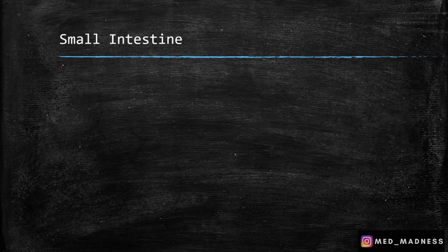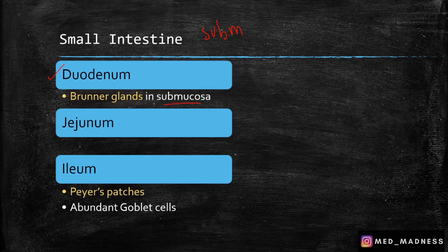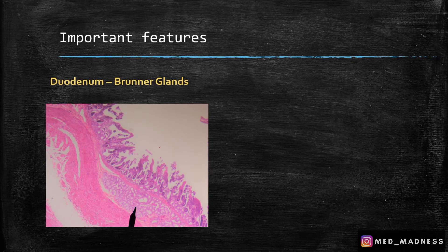The crypts of Lieberkühn are important because they contain stem cells and Paneth cells. The stem cells help in regeneration of cells, and Paneth cells help with secretions that protect the GI wall. Now I'm going to cover the different parts of the small intestine: duodenum, jejunum, and ileum. The general feature is villi, but to differentiate between these three, you look into the submucosa. In the duodenum, you can see Brunner's glands in the submucosa; in the ileum, you can see Peyer's patches.